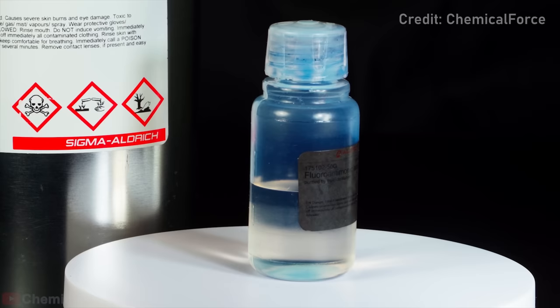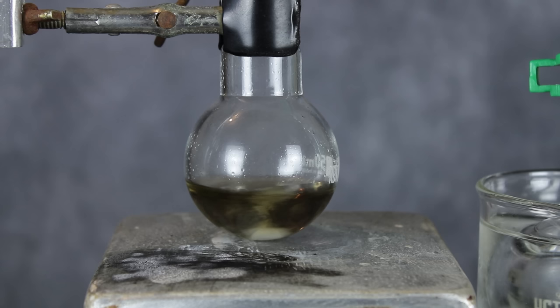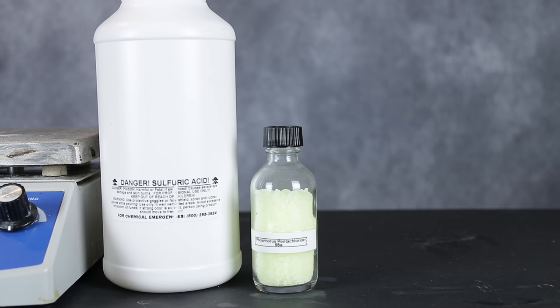So yeah, we're making a super acid today. And while I'd love to go all the way and make fluoroantimonic acid, I still lack the necessary hydrogen fluoride, so that'll have to be a later project. Instead, I'll be synthesizing a small amount of chlorosulfonic acid, which is actually pretty close in terms of how terrifyingly corrosive it is.